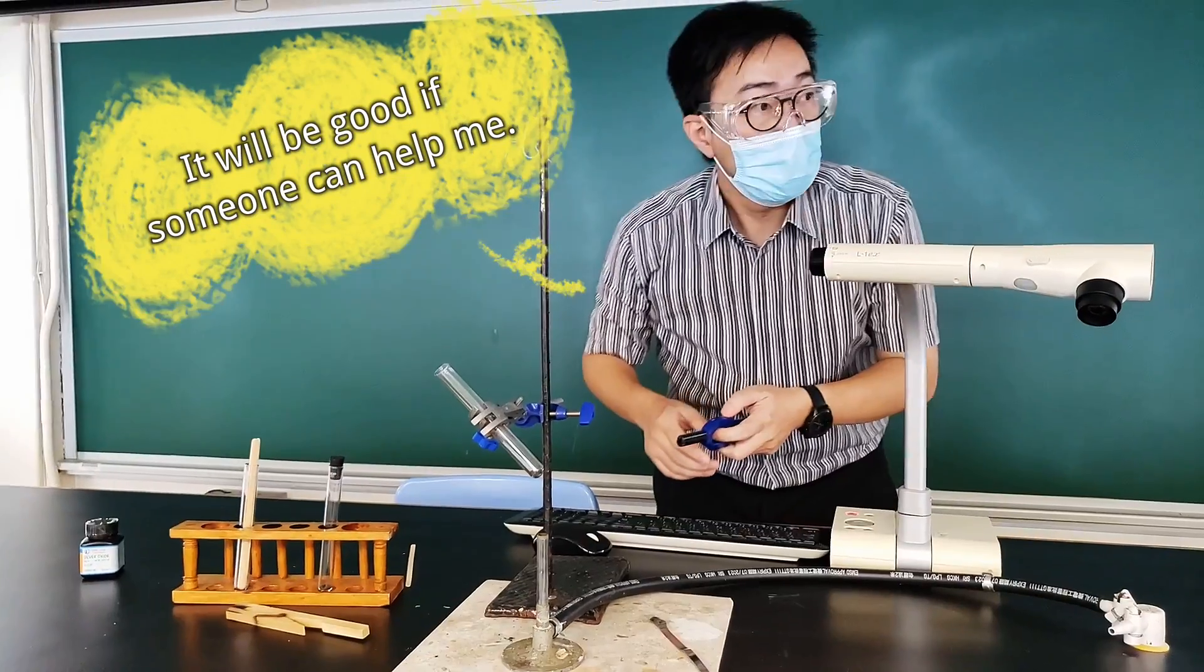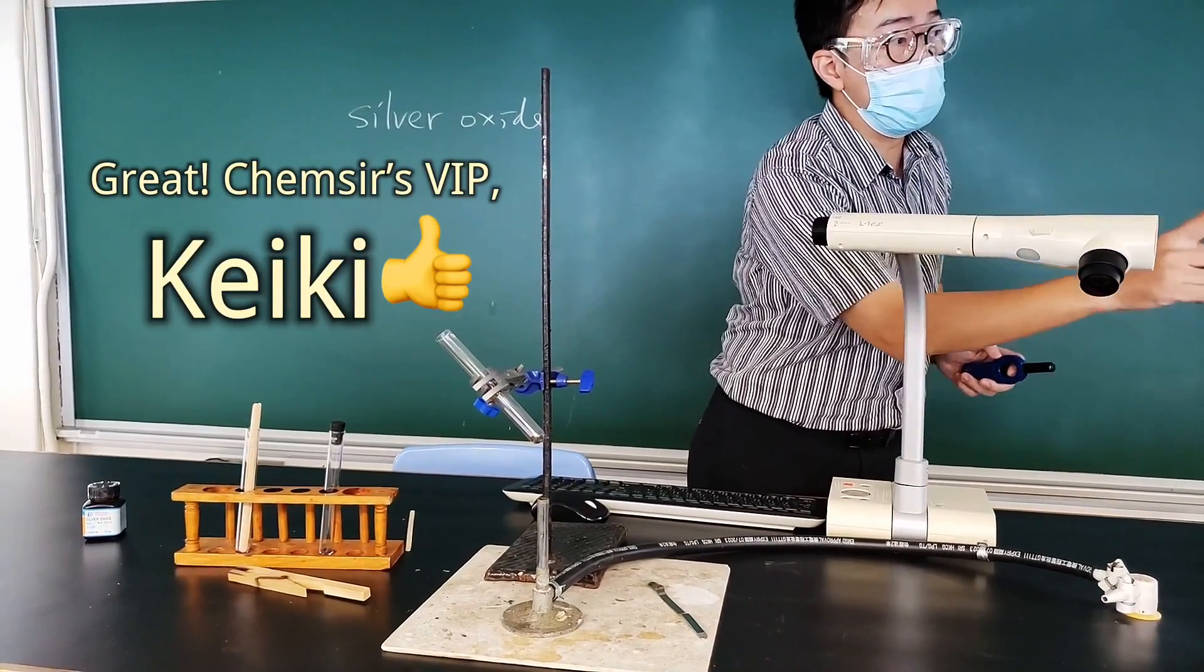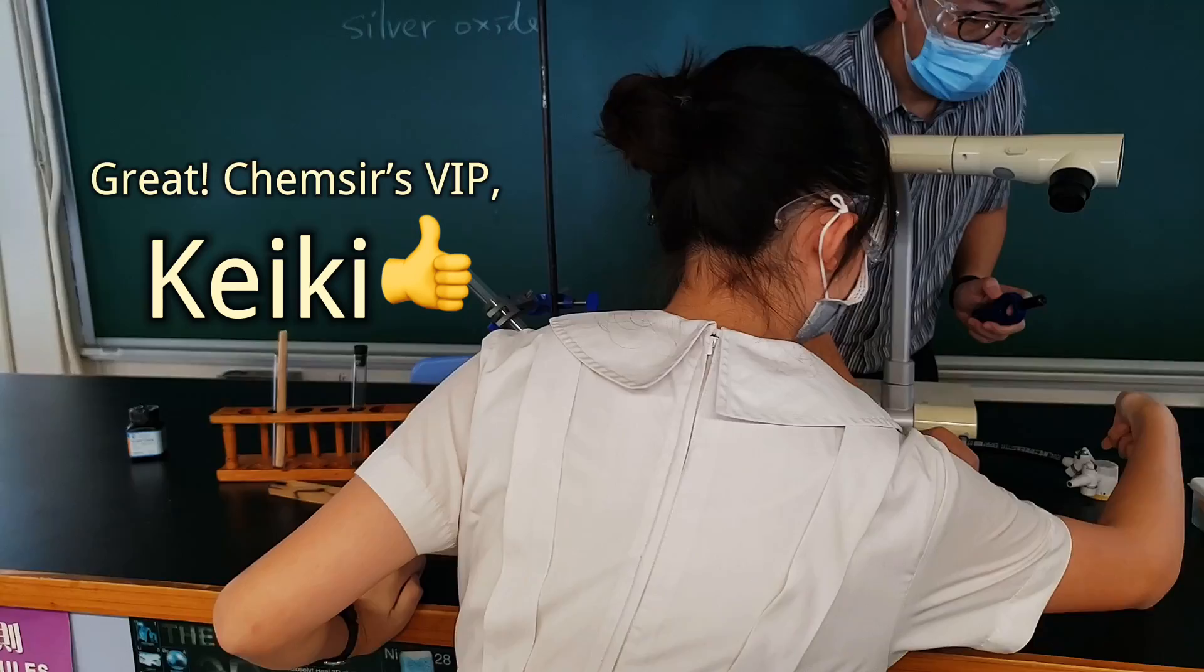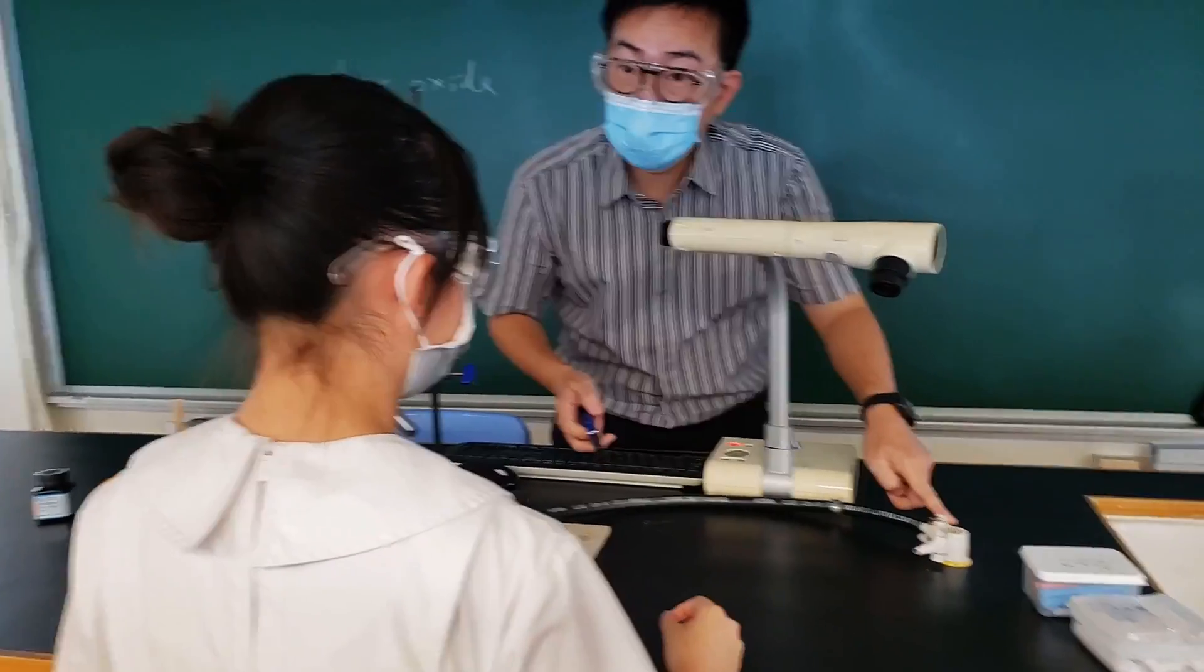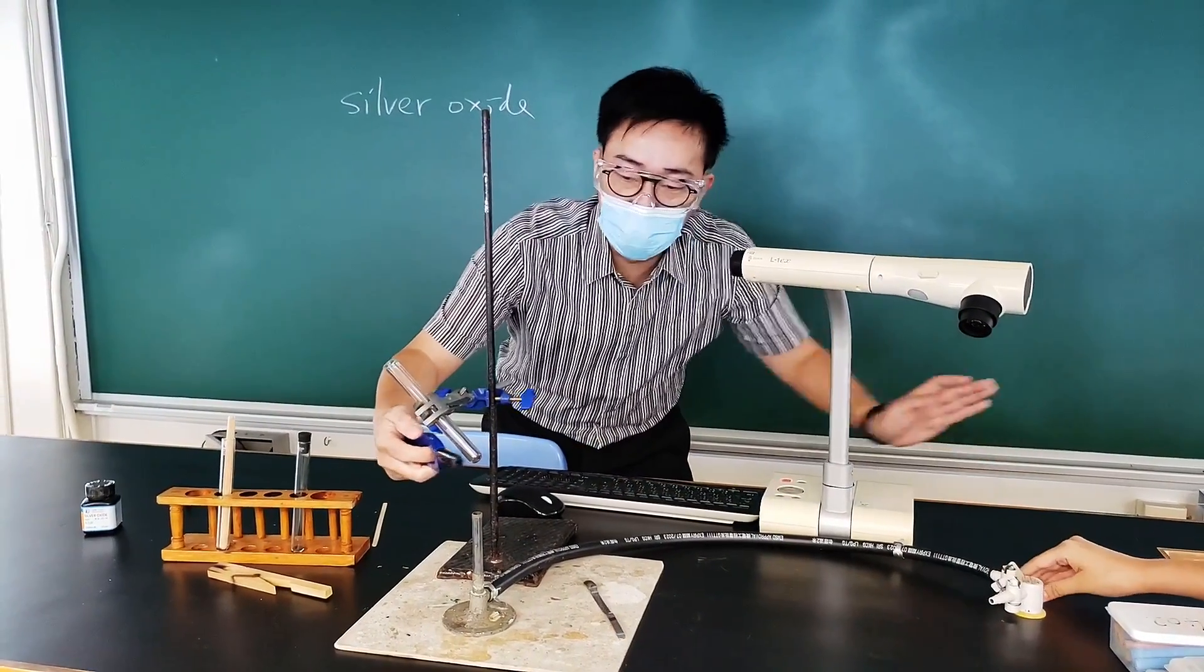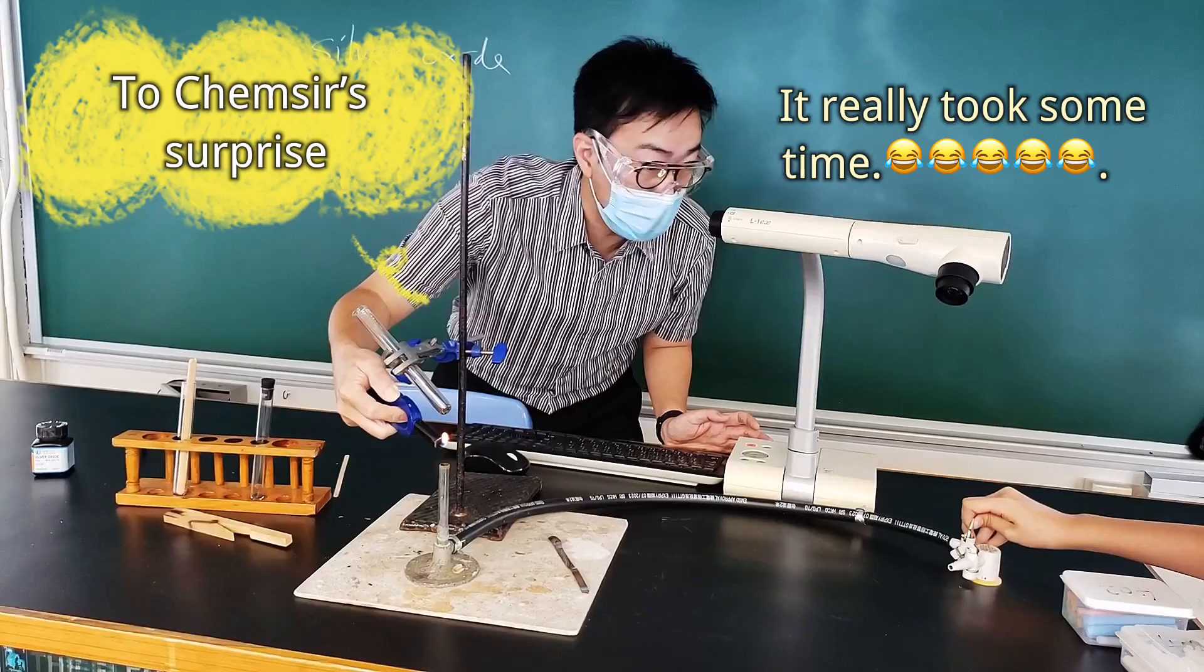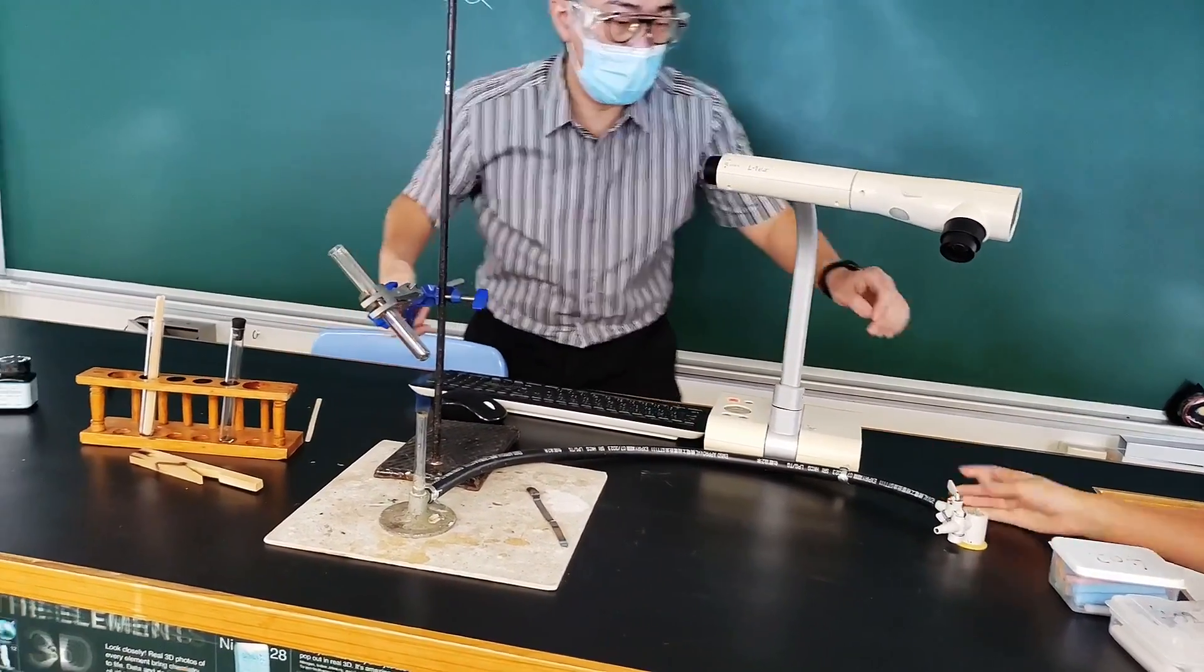Light the burner. Shut that, take it. Oh yes, we are here. But be careful, do you understand? Which one are you going to turn? Yes, this one, okay. So maybe you turn to get started. Okay, I have to do the light head. I light first. Yes. Do you remember how to turn the back? Yes, okay, successful.